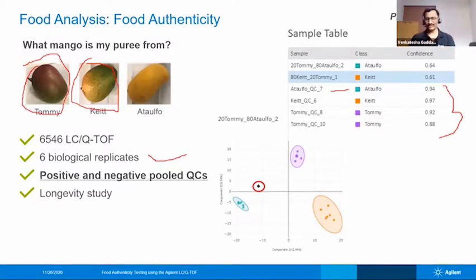So the sample extraction is very, very important. That's why sometimes we don't do SPE cleanup and all, because we don't know what to target. We do a simple extraction procedure, or maybe a QuEChERS extraction, so that you have minimal sample cleanup and the rest will be taken care of by the mass spec. But it has to be the same, yes.